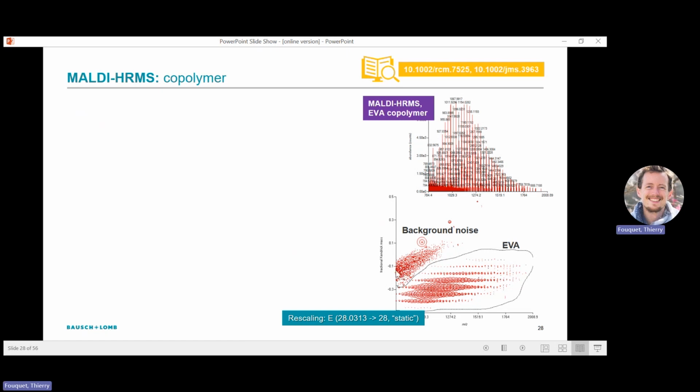And I want to show this example. It's very important because you should look at these plots not as static frozen pictures, but as dynamic interactive tools. If you have the proper program, if the software that you use to make these plots is good enough, you should be able to extract, to select, to isolate these points from that plot and process these points sequentially.